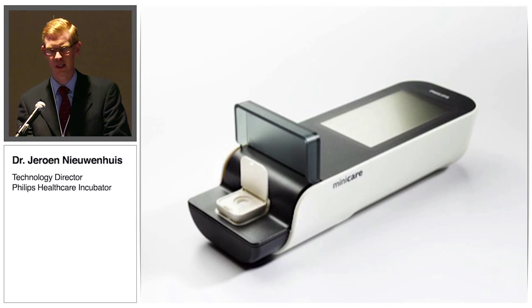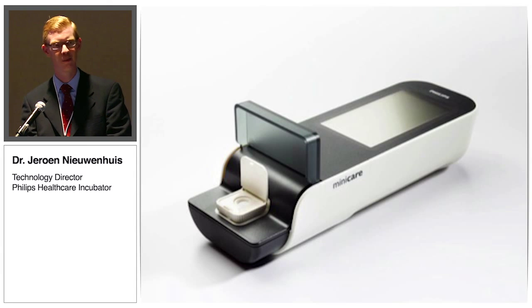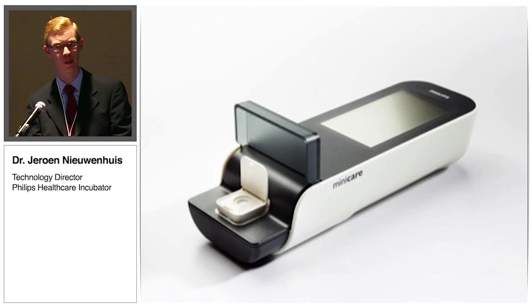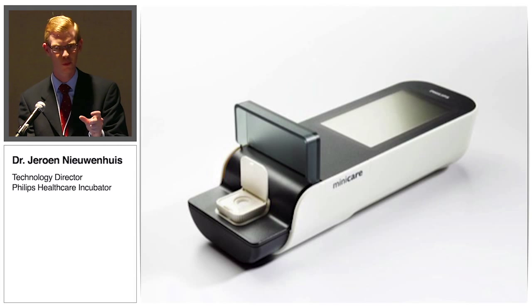A third element that you could also see in the movie is that we use these magnetic particles, and one of the key reasons we use the magnetic particles is because it gives you a very large surface-to-volume ratio. Once these particles are distributed in the reaction chamber, the average distance between the particles is less than 10 micrometers. So that means even if diffusion is the only means of mixing or getting the reagent to your particles, with such small diffusion lengths, the system is no longer diffusion limited.